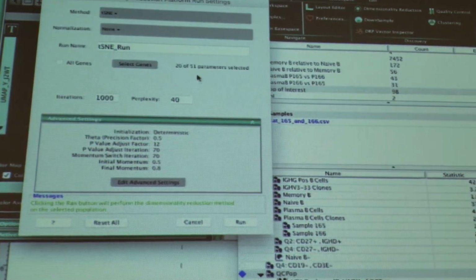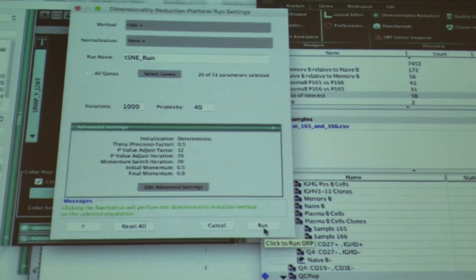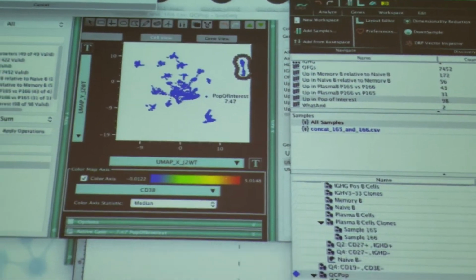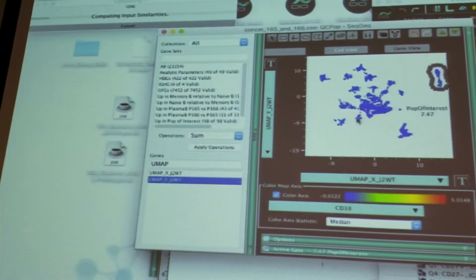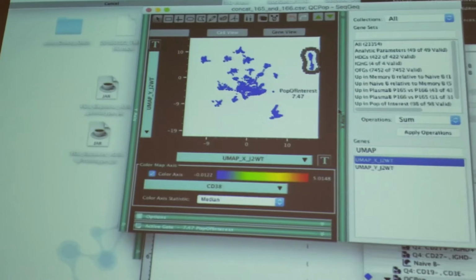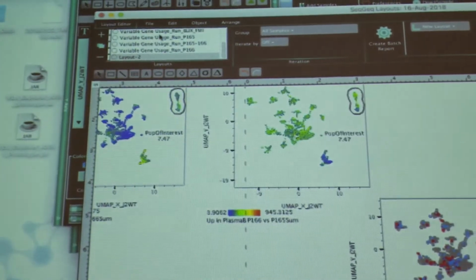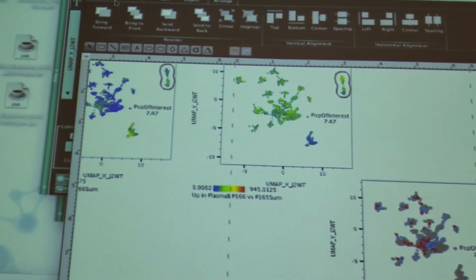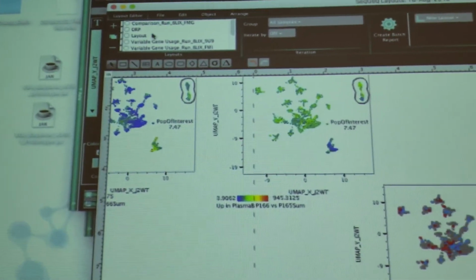Is this just those cells? Tizian, just those? I think it's the one you selected, right? I don't know. Are these just the ones we selected? These are whatever I defined as QC pop. I think I actually have a layout that shows how I did QC here. Where is it? Oh boy. Might just be my first layout.